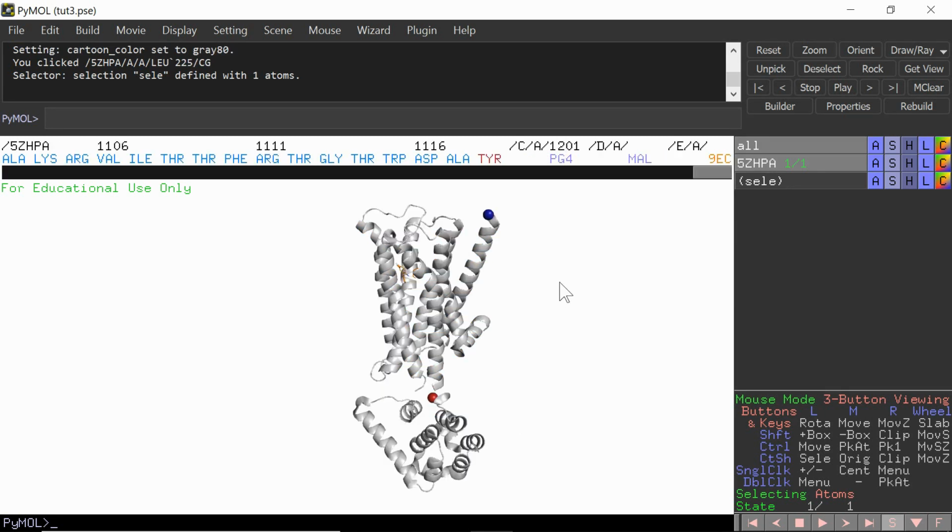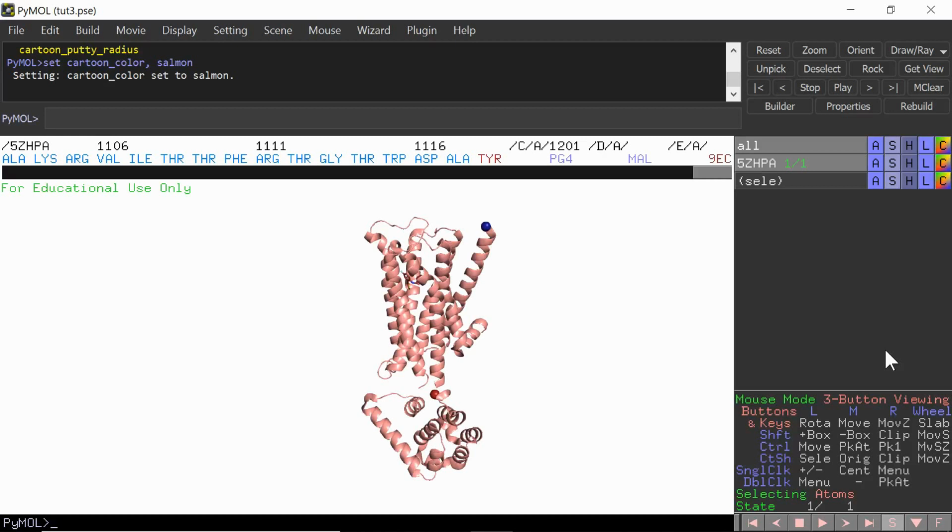In this instance, contrast is being used between the ligand and the receptor. Notice a lack of contrast is being used between the intracellular and extracellular portions of the protein. What this does is put the emphasis on the ligand binding to the receptor rather than the two portions of the protein. In the first example, one could argue the contrast was being used to highlight the receptor. In the second example, one could argue that the contrast is being used to highlight the ligand.